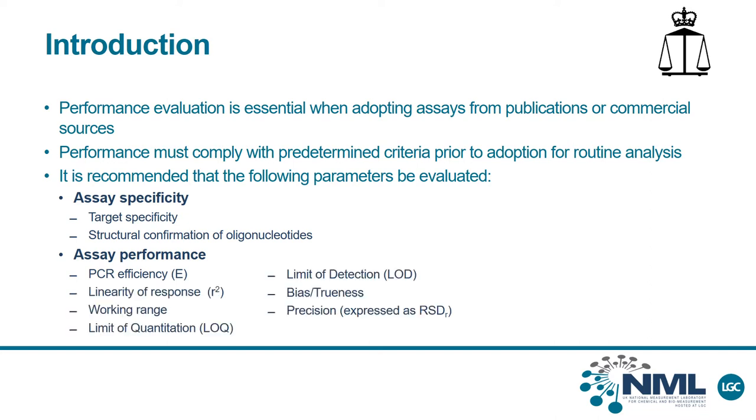Recommendations and guidance on best practice in undertaking assay validation and verification are available, but are frequently highly technical and complex in content. This e-seminar will provide an introduction to which parameters to evaluate and how to incorporate them into a stepwise assay validation or verification procedure. For the purposes of this e-seminar, the word validation will be used, but the process is equally applicable to the verification of the performance of assays which have undergone a previous validation.